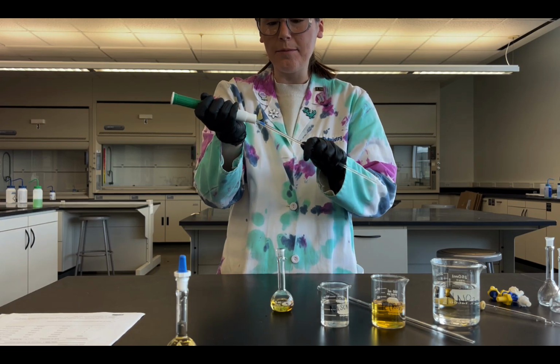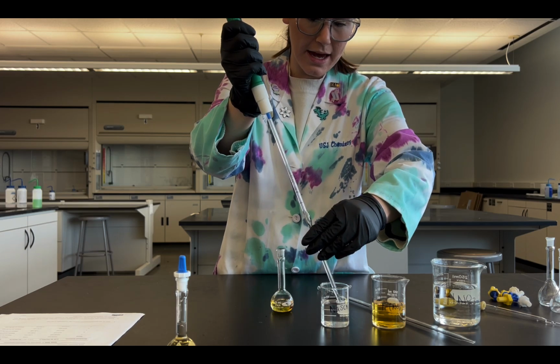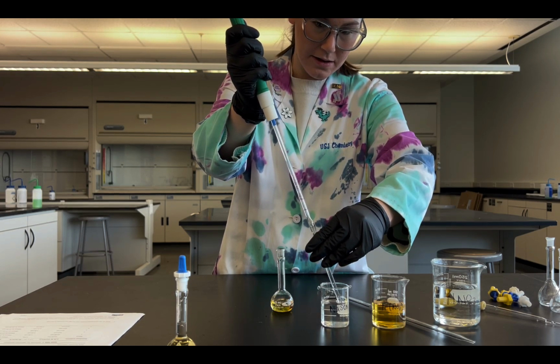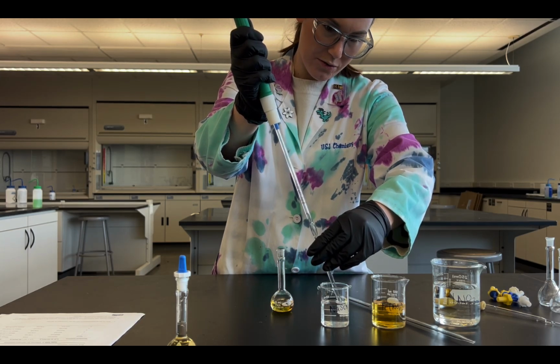Now I'm going to add my 1 milliliter of my thiocyanate. I'm going to take my 1 milliliter pipette and do the exact same thing. And what we're going to see is a slight reaction.